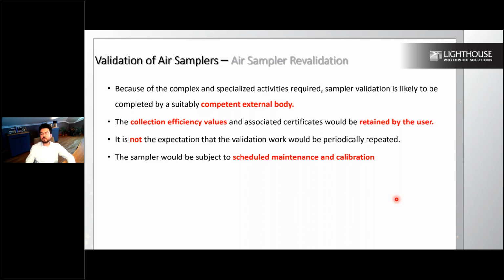So whatever you receive from your manufacturer, you have to verify this information, test it and adopt it into your system. So the retention has to be done by the end user. There is no expectation that the validation work would be periodically repeated, because once it's done, either your impactor or the sampler system will be the same.